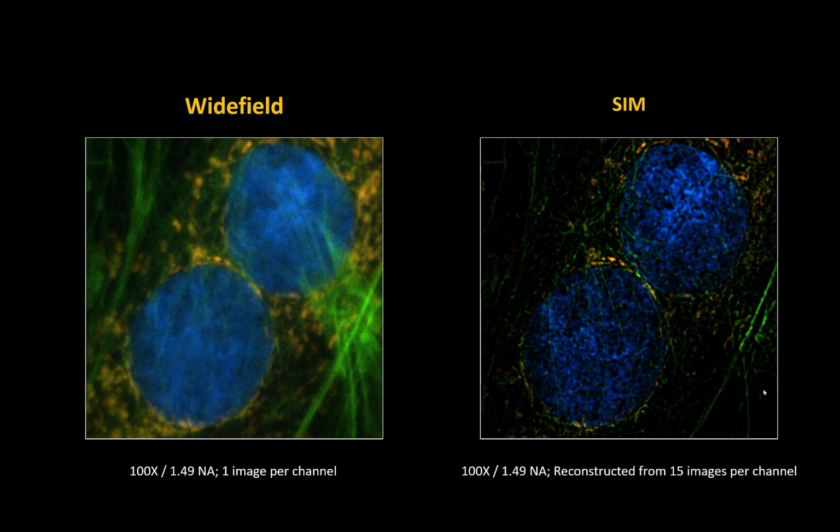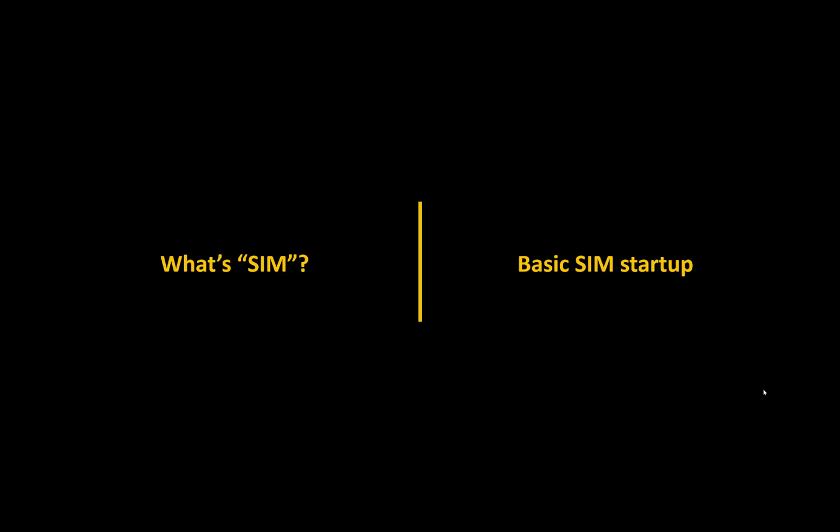And that's one of the really great strengths of SIM: if you have finer structure in your images, you can really tease that out using SIM compared to just a standard wide field setup. And it doesn't take that much longer to acquire a SIM image over a wide field one. So that's SIM. Now let's talk about how to start up our SIM instrument here in the Bach.